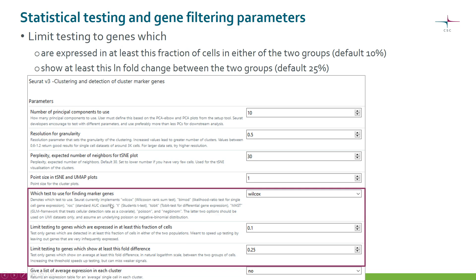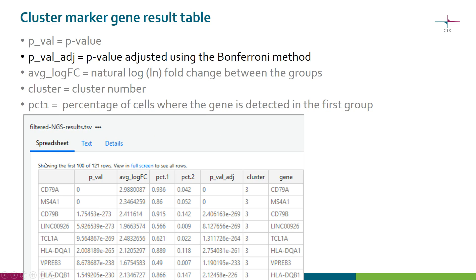Looking at the actual parameters: the tool for clustering and detection of cluster marker genes does many things, but these particular parameters are relevant for finding the marker genes. First, you have to specify which test you want to run. Then for filtering you have two options: you can limit testing to genes expressed in at least 10% of the cells in the cluster or all other cells, or you can limit testing to genes which show at least a specified fold change between the two groups. Note that the fold change is in the natural logarithm scale, not the log2 scale as is usual in other tools.